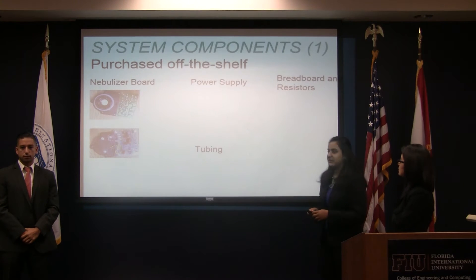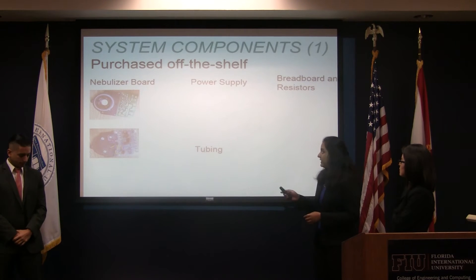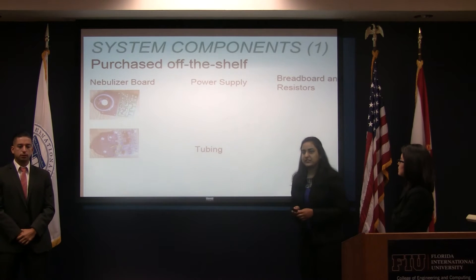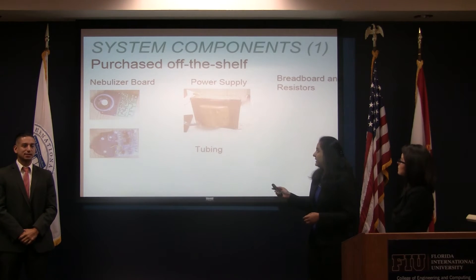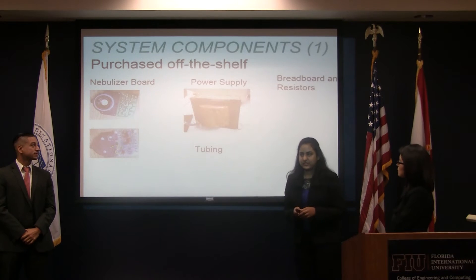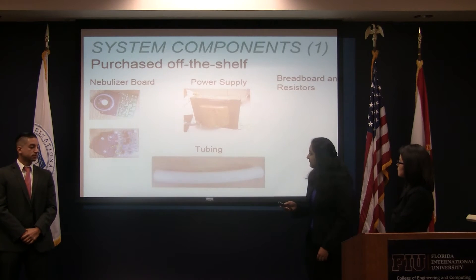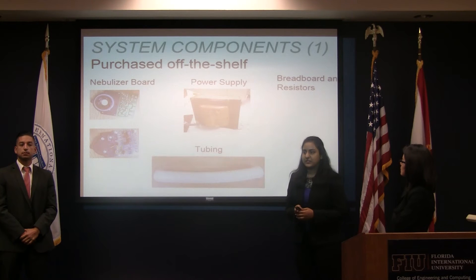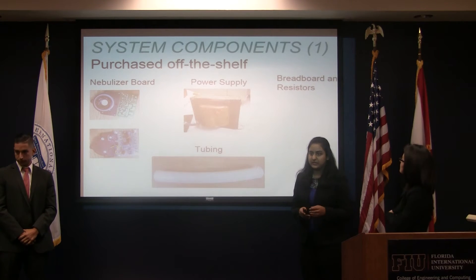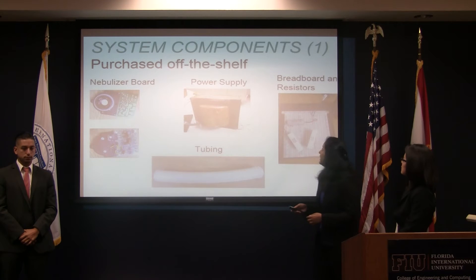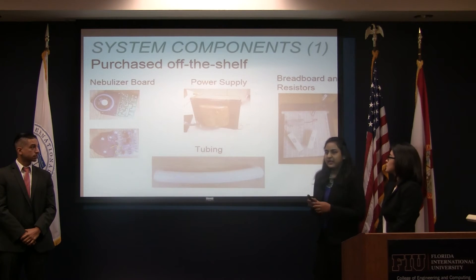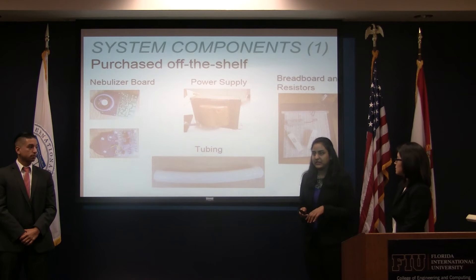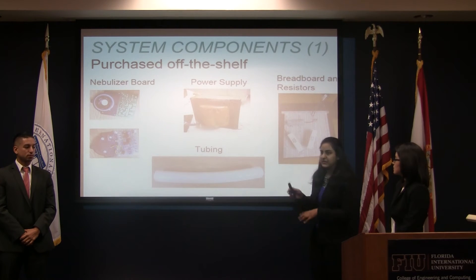We divided the system components into three sections. There are some parts we bought off the shelf: the first is a nebulizer board that runs on a frequency of 1.7 megahertz; the second is the power supply, which has a 48-volt AC for the nebulizer board; the third is crush-resistant, high-temperature silicone rubber tubing; and the last is a breadboard and resistors, which we needed because the power supply wasn't giving us the output we needed, so we used the circuit to bring it down to 48 volts.